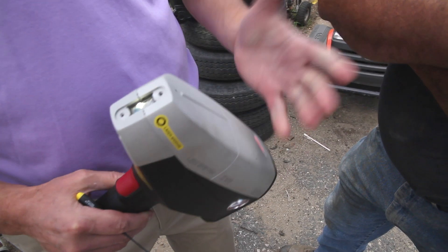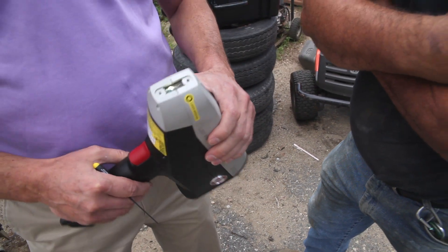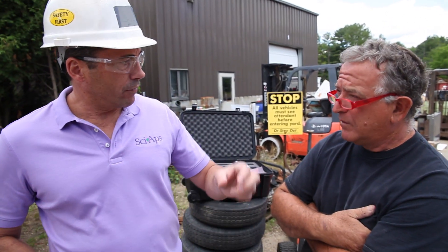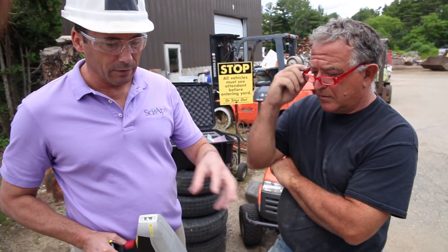We make the laser and we make the spectrometer. Our maintenance costs are less than a tenth of an x-ray device. Because if you somehow drop this and manage to break a laser, it just means maybe you've knocked a mirror loose or got a part knocked loose — we can just repair that component. With an x-ray tube, when it fails, the only thing you can do is a full x-ray tube replacement.